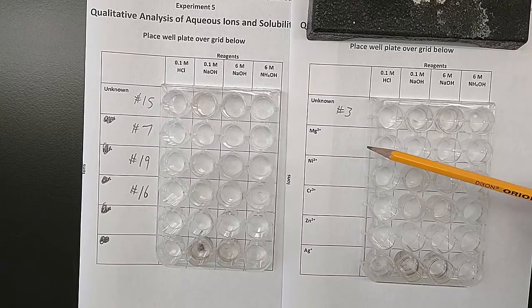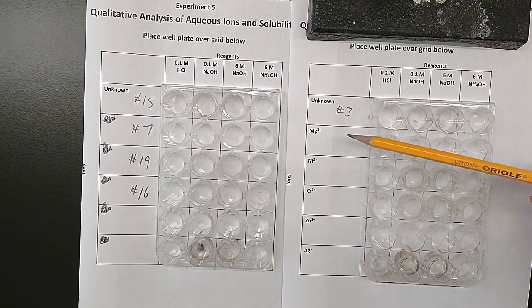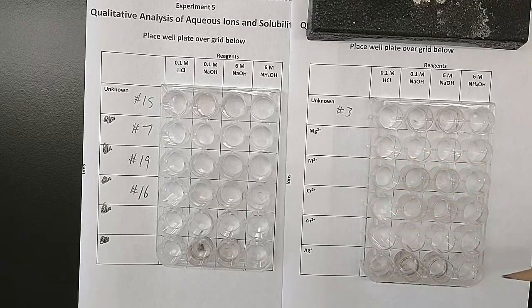And we know that they're present as the nitrates, okay? You can't just have cations without anions. Our anions in all of our cases are nitrates.